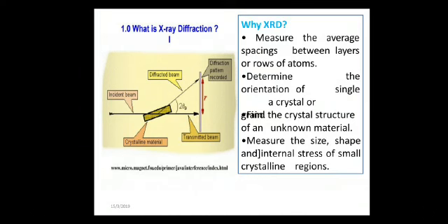So what are the other strengths of using this X-ray diffraction? The other strengths are that it is a powerful and rapid technique for identification of an unknown material. In most cases, it provides unambiguous mineral determinations, minimal sample preparation is required, and data interpretation is relatively straightforward. So these are some strengths of X-ray diffraction.